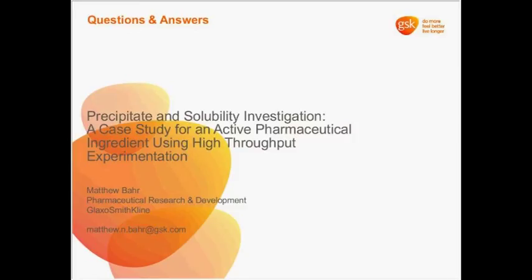You have to consider the amount of excipients in the tablet formulation itself. So if I have a 31.5 milligram dose of API in a 200 milligram tablet, I want to ratio the amount of HPMC that I'm including in my experiments on the Freeslate machine so that they are in context with what that formulation looks like.